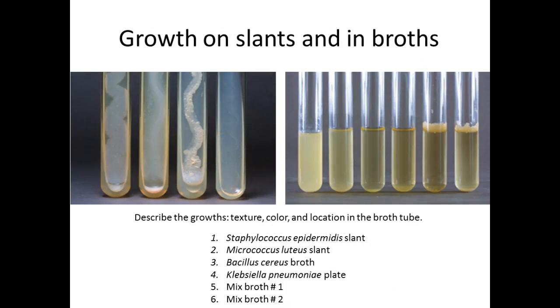So growth. Growth is going to look different based on the media, right? Here you can see it growing on the surface, but in these broth cultures, this one's kind of cloudy all throughout. It might be a motile organism. It's swimming around. These guys are just at the top, right?